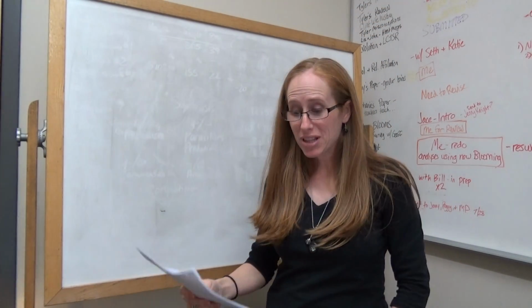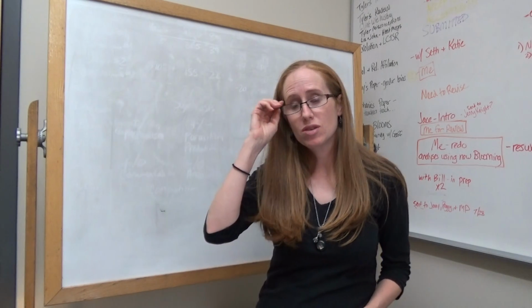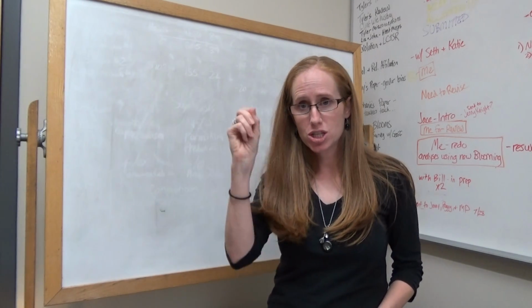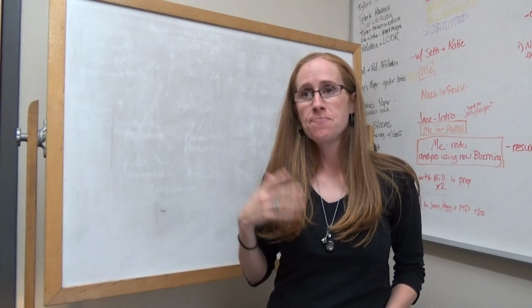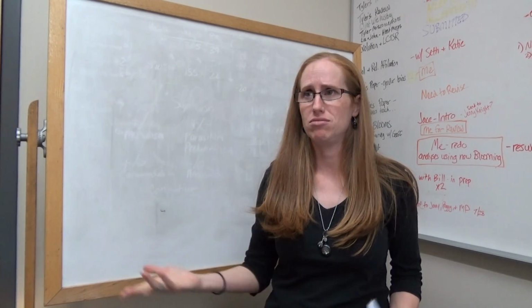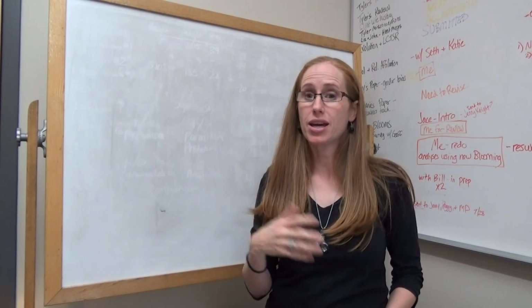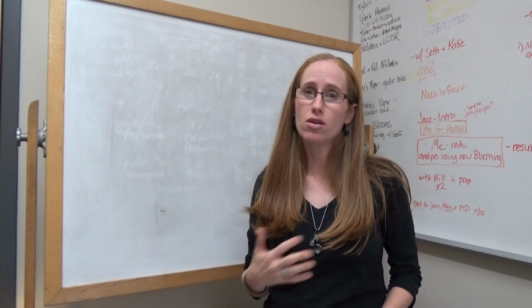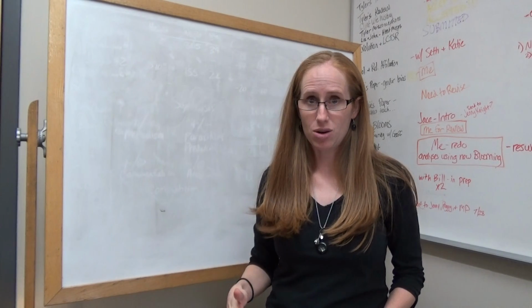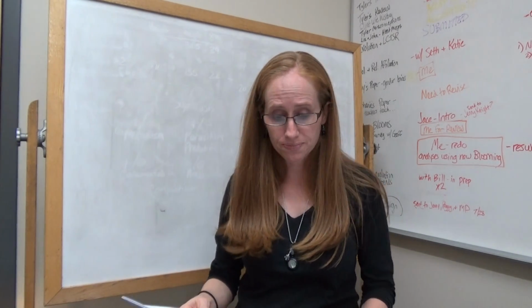Okay, we're going to talk about the population lab. That's what's this week. So hopefully at this point the students have all been keeping track of their fruit fly populations by putting little dots on the sides. And the fruit fly populations should all be pretty much dead now. Oh, they definitely should be dead now. And so for the lab tech, after this lab is over, all of those jars can be cleaned out because we're done with them. And you can clean the markers off the side of the jar.